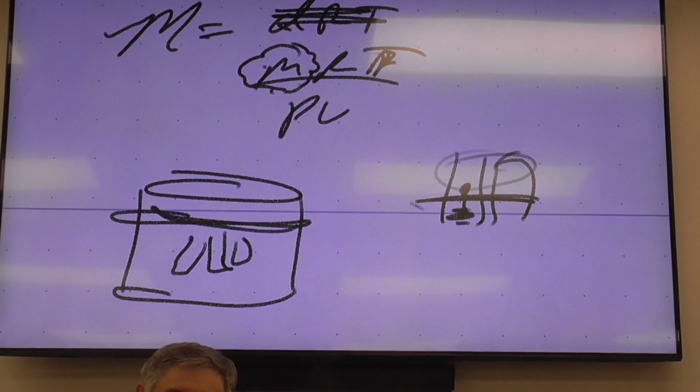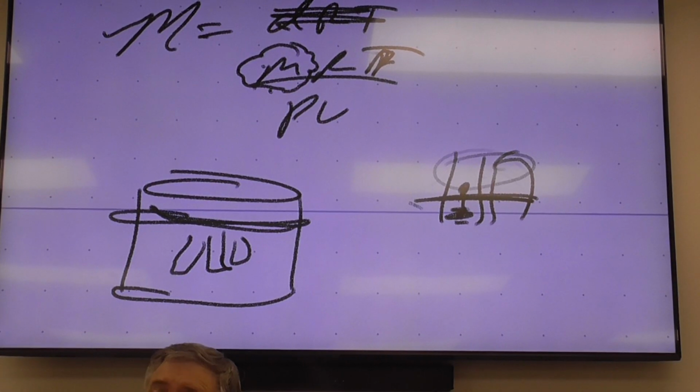So you're going to need the mass afterwards. So this is going to be coming out of water. What you want to do as quickly as possible, oh, you guys get to use paper towels, is dry these off. Okay, so you're going to have this little bit of liquid in the bottom of them. Dry it off so you don't have the water on them. Then you're going to find the mass afterwards.